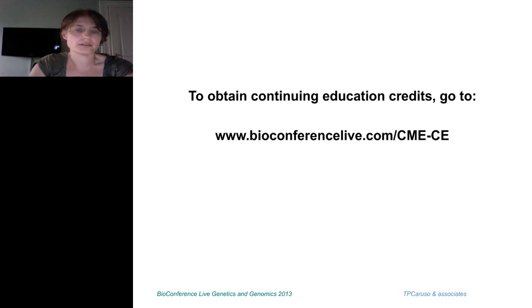I'm not exactly sure, because if your lab is a CLIA lab, there will be particular recommendations on what you need to do to certify your sequencers for use in a CLIA lab.